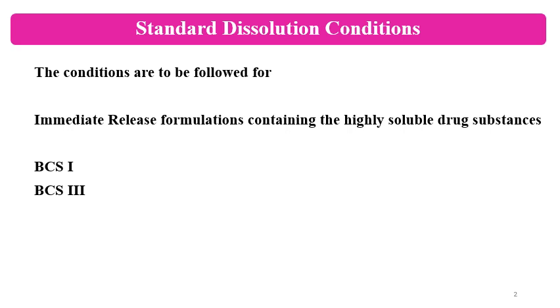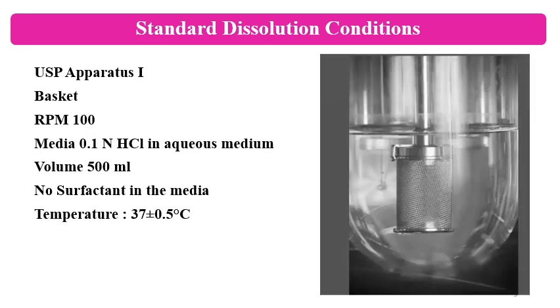These standard dissolution conditions are not applicable for sublingual tablets, buccal tablets or ODT formulations. As per the current understanding of the guidelines and requirements, the standard dissolution conditions are required to be followed. Mainly the USP apparatus 1 basket and USP apparatus 2 paddle. These two apparatus are used for dissolution testing of immediate release formulations.